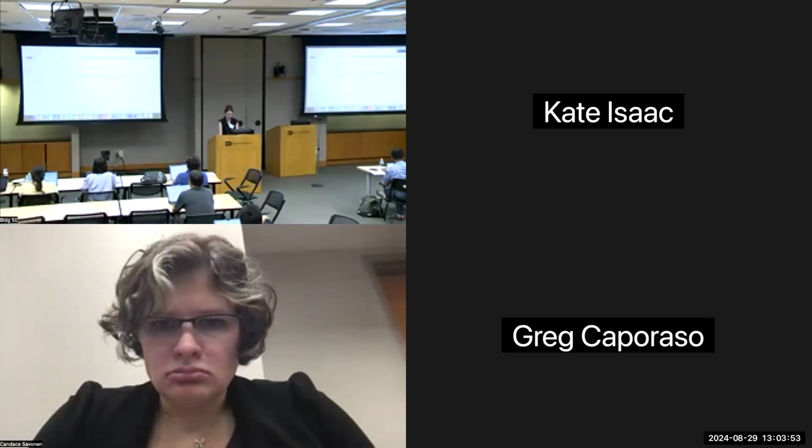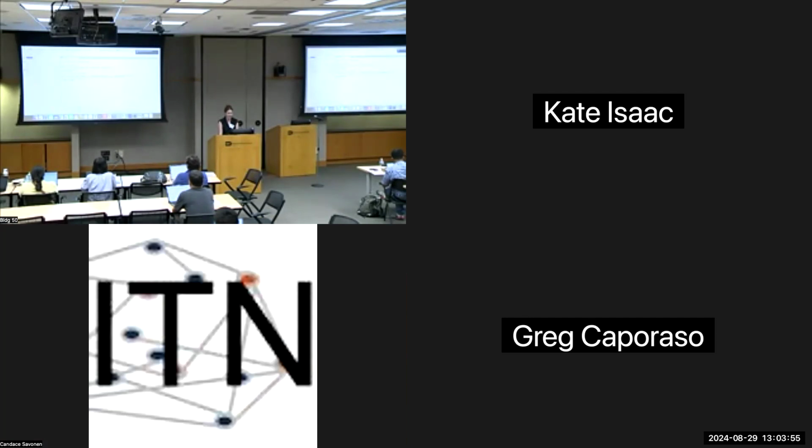I could type it all out, but I'm going to see if I can tab complete. Okay, so it gave me the dash, but then I had to give it the PR and then I could tab again. Okay, so now I have my command. And at this point, you could do --help if you weren't sure what inputs you needed. Let's go ahead and do that just to see.